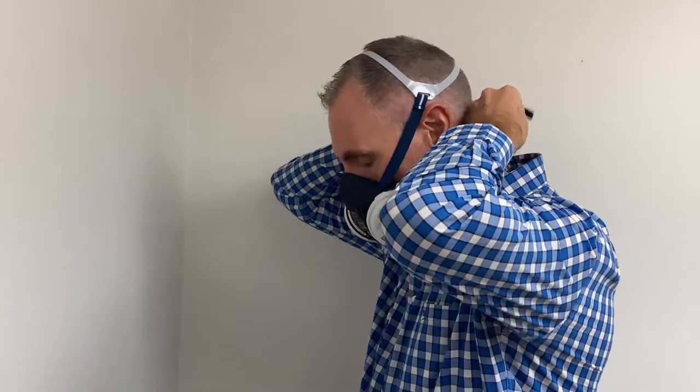To perform a negative pressure fit check, simply block the filters using the palms of your hands and inhale gently. If you feel air leaking in between your face and the mask, adjust your mask and tighten the straps before repeating the negative pressure fit check. If a proper seal has been achieved, the mask should collapse slightly and pull toward your face with no inward leakages between the mask and your face.